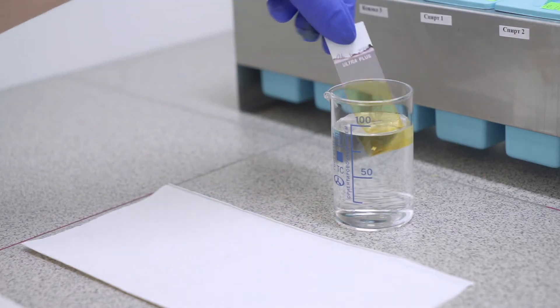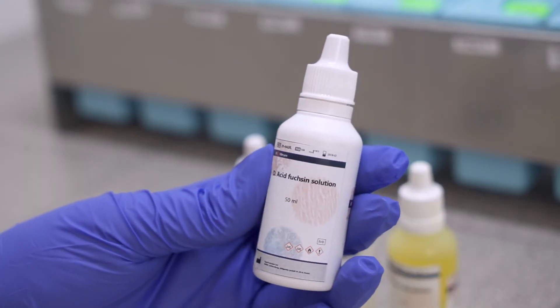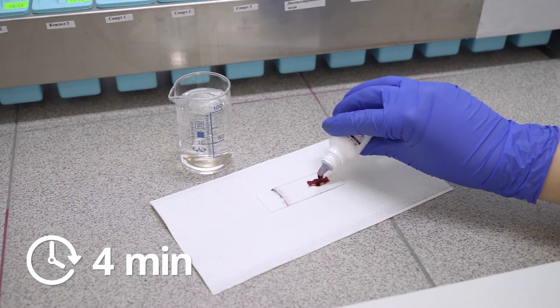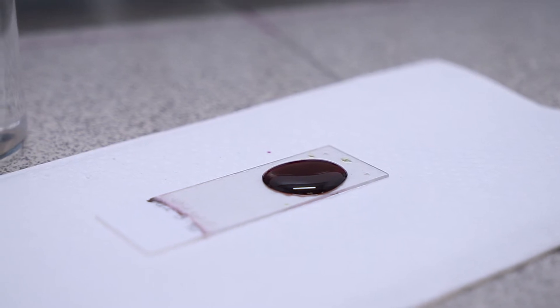Wash the slides quickly in distilled water. After that we put on the slide solution D — acid crimson fuchsine solution — for 4 minutes.